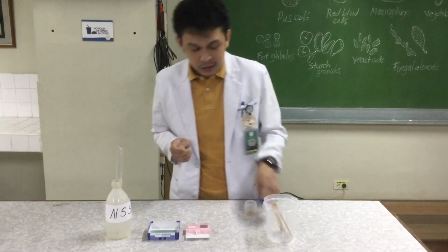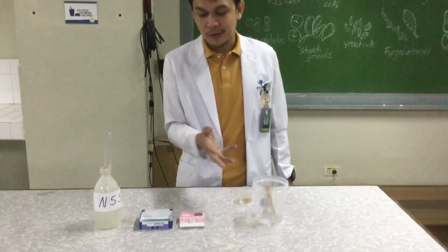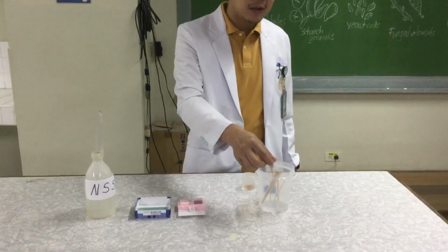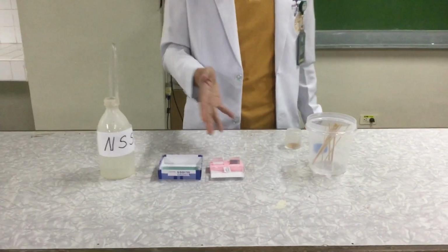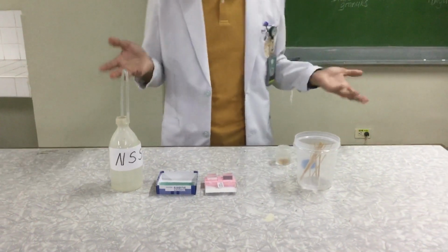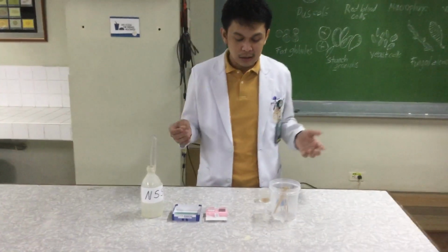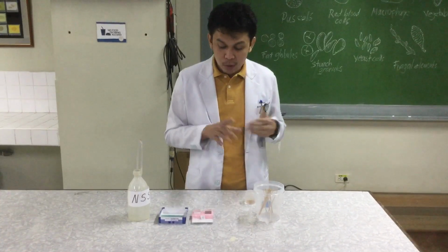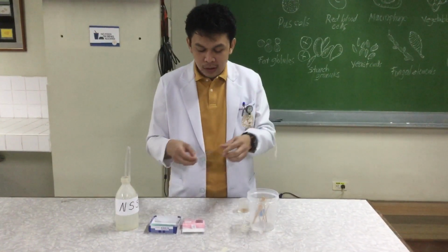Now, in the fecal smear preparation, you will need these materials. You have here the applicator sticks, clean slides, cover slips, and of course the normal saline solution. And if possible, you are allowed to use iodine as a temporary stain. Now, what will you do right after that?